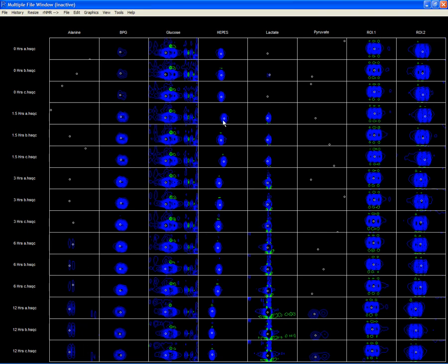Because each of these boxes contains data from within the ROI chemical shift boundaries, we are able to view these changes. This type of analysis would be much more difficult if we had to rely on peak lists.